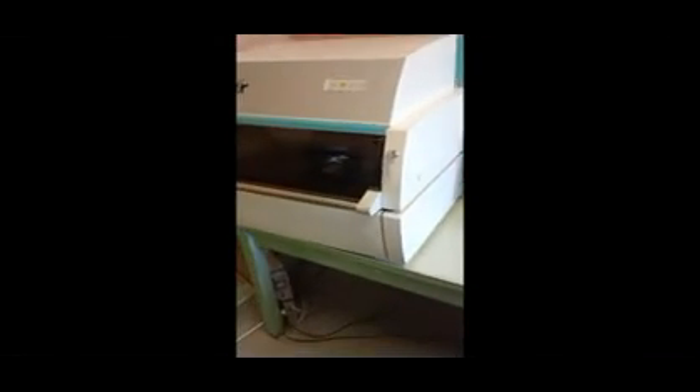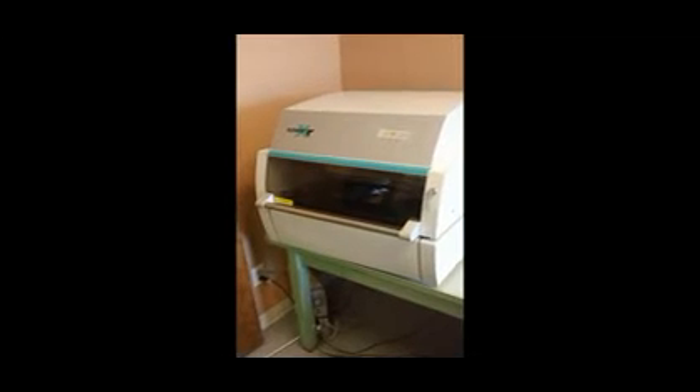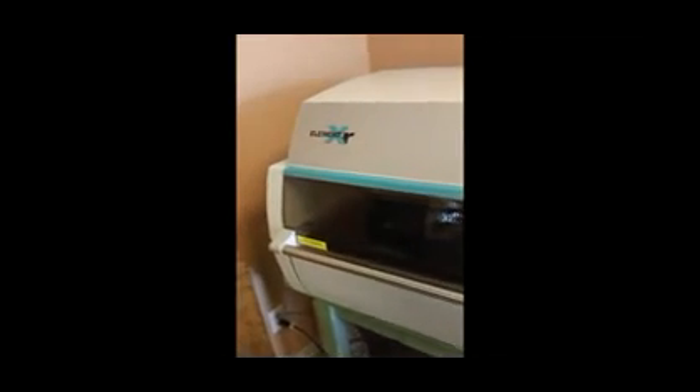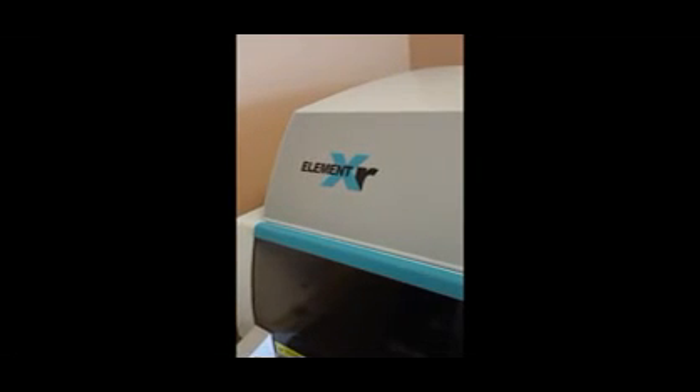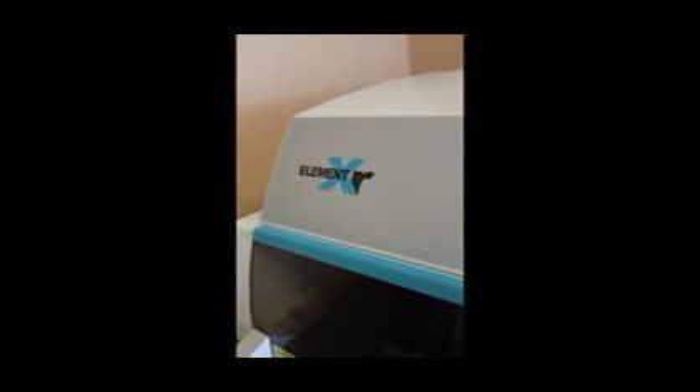At Eastern Applied Research, we believe the chamber design and software of the M5, combined with its price to performance ratio, make it one of the top values in coating thickness XRF instruments. Contact an associate at Eastern Applied Research to discuss your needs and how the M5 might be the key to solving your problem. Thank you.